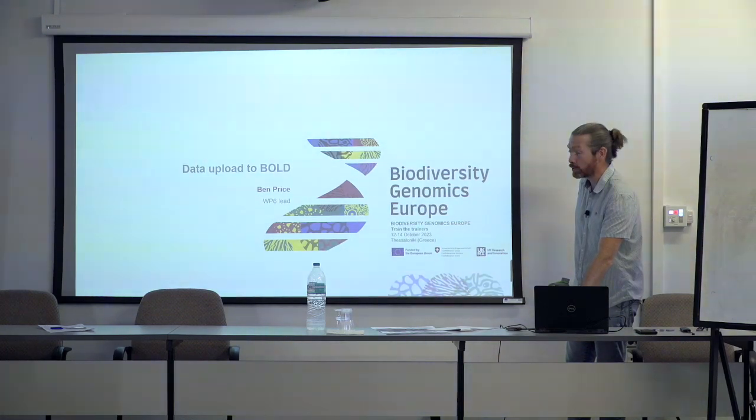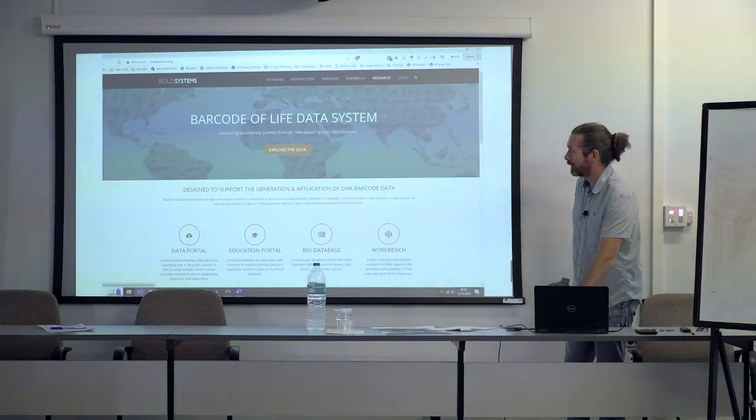So, uploading your data to BOLD. There we go. That's BOLD. Hello.